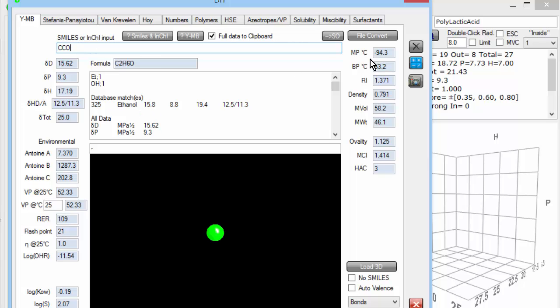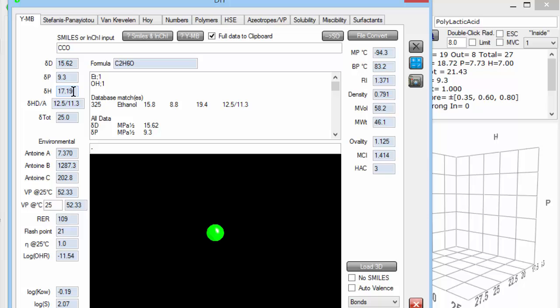Hit return or press the calculate button. And it says there's one ethyl group, one OH group, and it estimates from that that the HSP of 15.6, 9.3 and 17.2. It then looks in its database to see whether it actually has something like this, and it finds that the real ethanol is 15.8, 8.8 and 19.4. So it's a bit low on the DH, but this is only an estimation scheme.